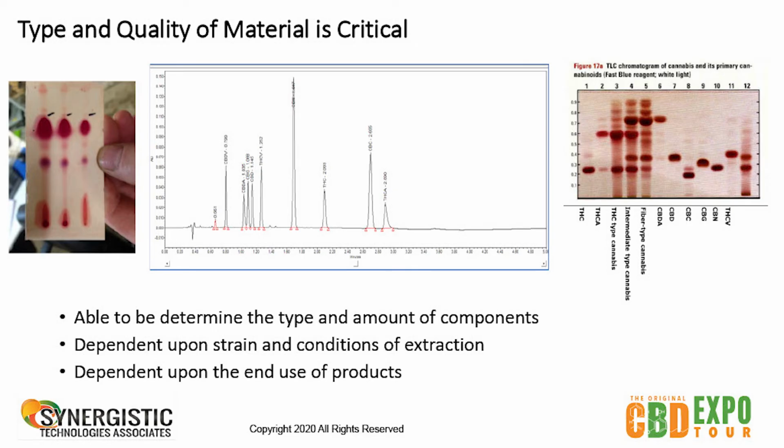So now if you correlate these, this is one that I ran probably in 2015 or so. Not the greatest chromatography, I didn't do the greatest job, but you can see that I had 3 different compounds and you can see they're different. And that's the one that we saw before that had the standards, and in between you can see what the chromatography looks like. So this one only has one, so it has a 1, 2, 3, 4, 5, you can start to see the smaller amounts, like these would be a smaller amount, and this is a larger amount. You can see exactly where those components are. And that gives you a very simple test, and it's well under $300, and certainly not so much per test, so you can do it every single day in your kitchen.